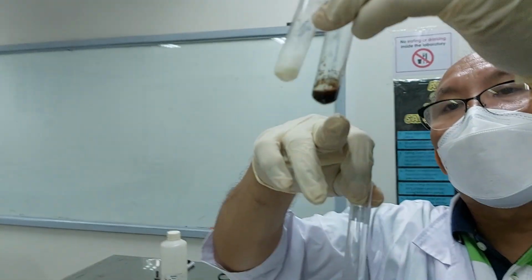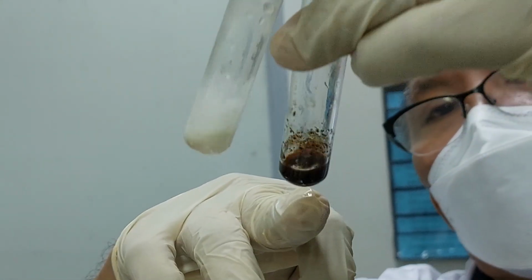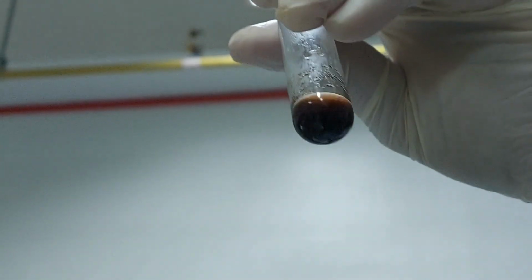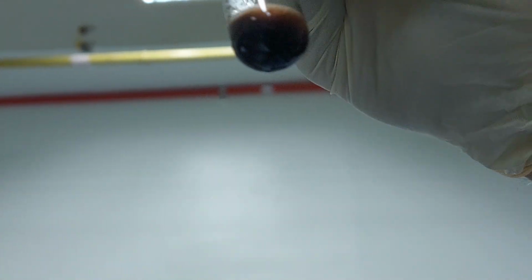There should be a mirror here, but it is covered with the black solution. But you can see at the bottom, it has to be shiny. The test tube is supposed to have a coating at the bottom, you should have silver deposited, it should glitter there.